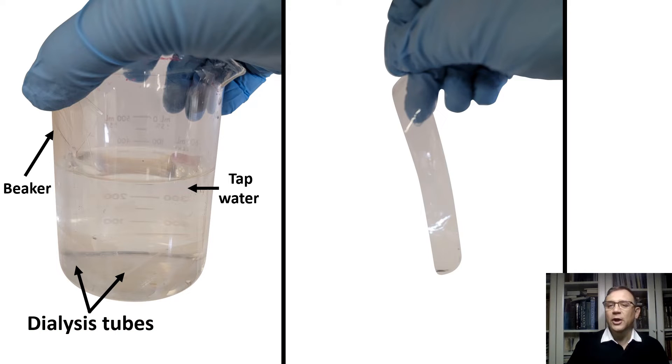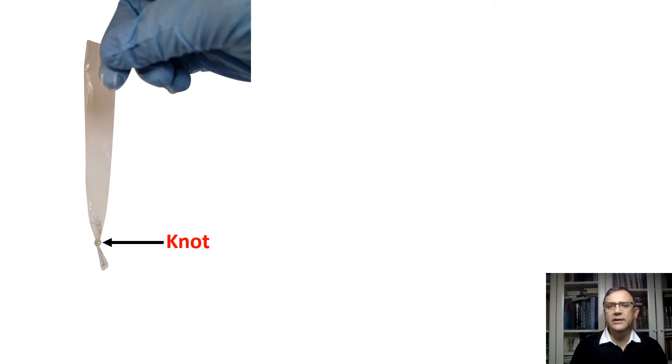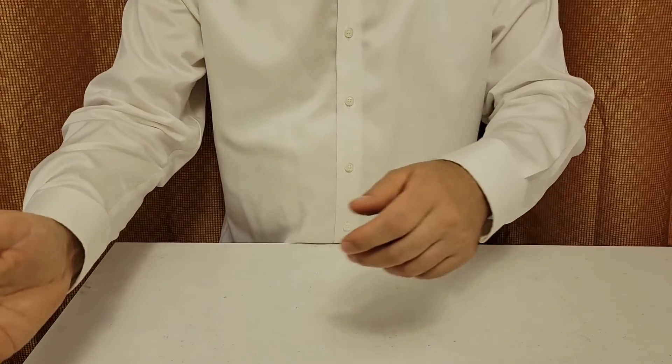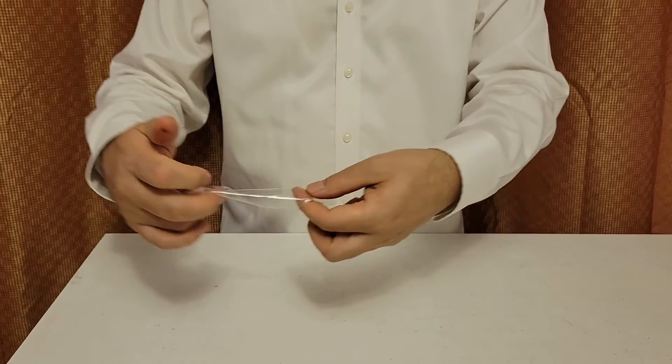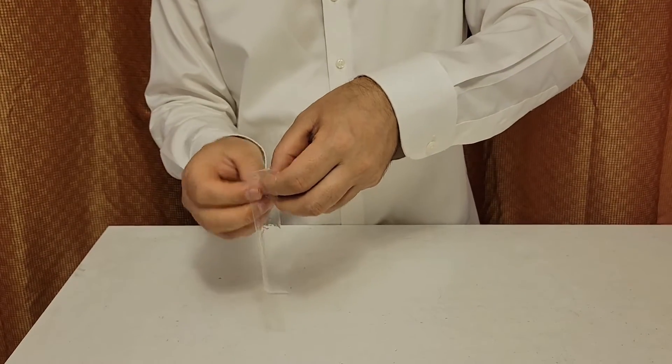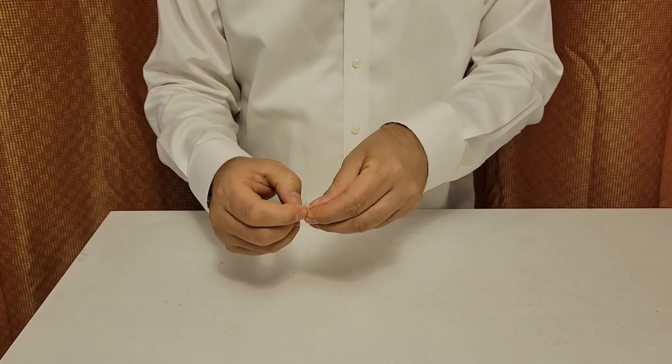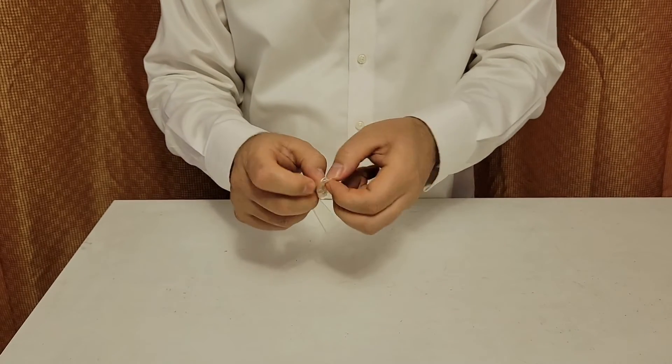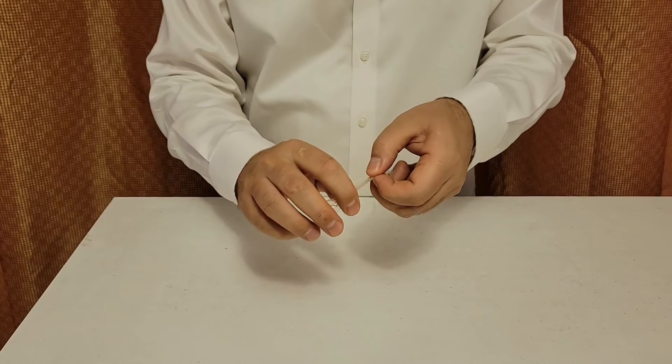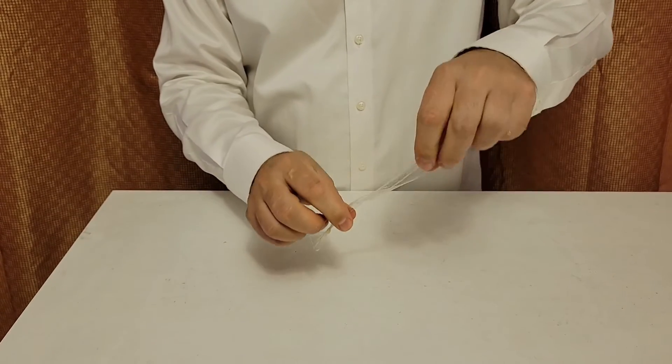After the bags have soaked, we take out one of them. We gently tie a knot at one end of the bag, being careful not to create a hole. Once the knot is secured, we open the other end of the bag by gently rubbing it between two fingers. After we soaked our dialysis tubes, we will have to make dialysis bags. For this, you will have to make a knot at one end, like I do. Here is the knot on one side of the bag. Do you see it? That's how it should be.